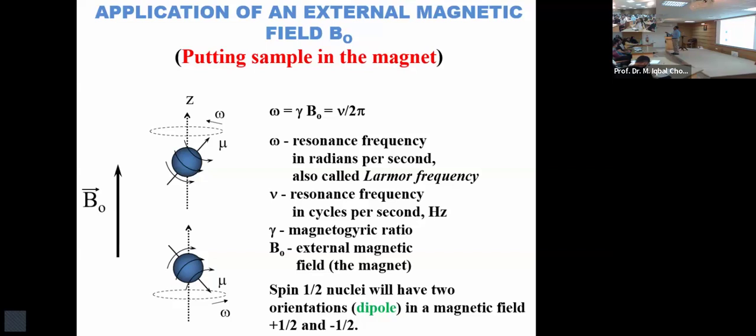So they used to add TMS into the sample. What a terrible thing it was, having your pure compound and adding impurity into it. And then after that, they started putting a small capillary of TMS inside to get the same result. But in this case, you can just take out the capillary. So she's right. Anyway, yes, sir.